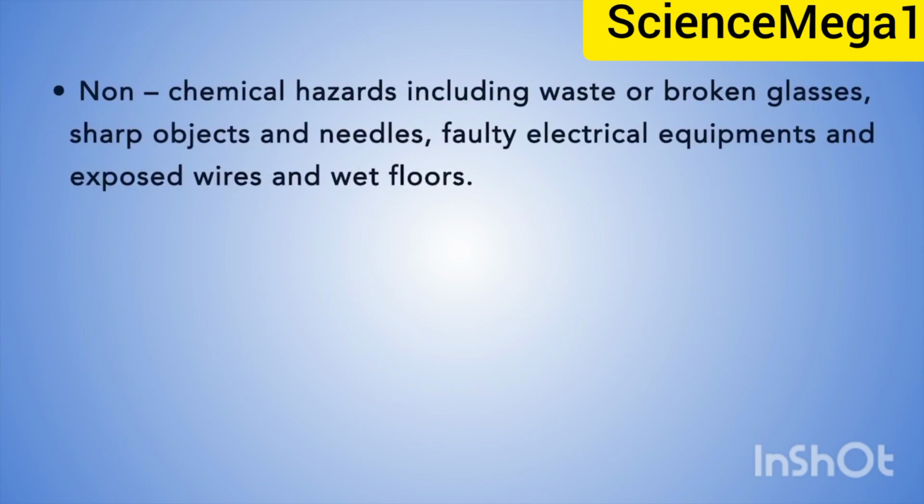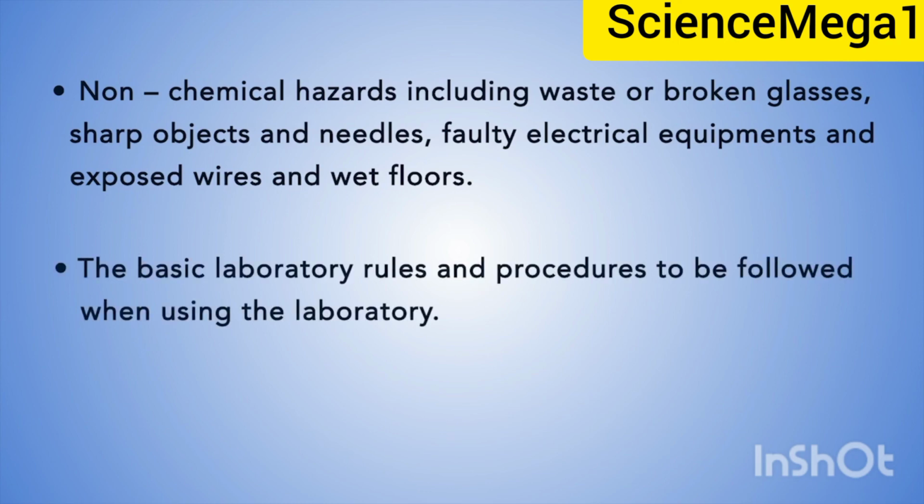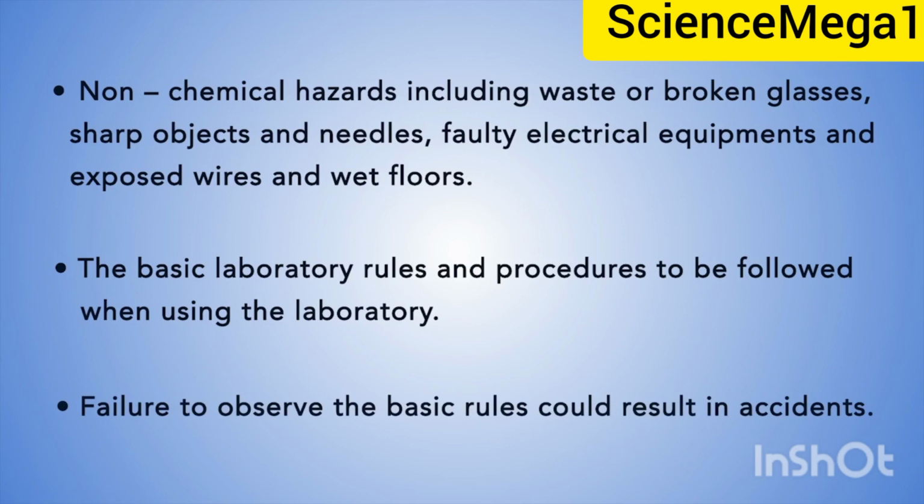3. We also looked at non-chemical hazards, including waste or broken glasses, sharp objects and needles, faulty electrical equipment, exposed wires and wet floors. 4. We also looked at the basic laboratory rules and procedures to be followed when using the laboratory. 5. When using the laboratory, failure to observe the basic rules could result in accidents.